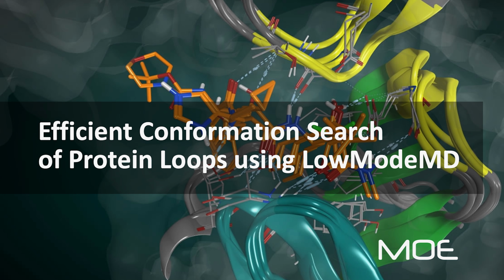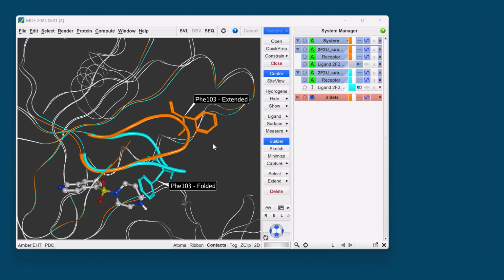Today I'd like to demonstrate how to perform a conformational search using LowModeMD to explore the movement of a flexible loop believed to have an important role in activity. So let's get started. Here we're working with a Rho kinase. The structure is actually a homodimer that's been superposed so that we can see the variability in the p-loop.